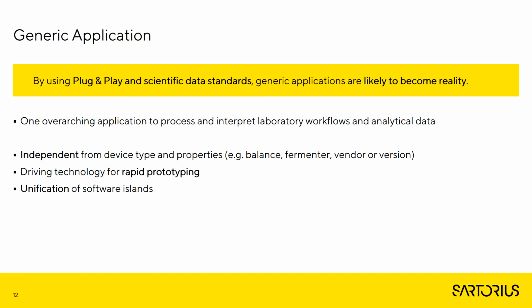Overall, it can be said plug and play paves the way for rapid prototyping of manufacturing and R&D pipelines and enables the unification and harmonizing of software islands. By using plug and play and scientific data standards, generic applications are likely to become a reality. This concept covers the establishment of one overarching application to establish, control, process, analyze, and interpret laboratory workflows and data while being independent from device type and properties.